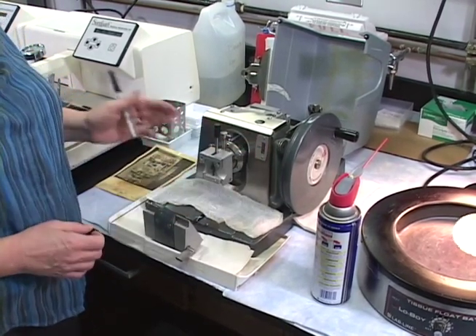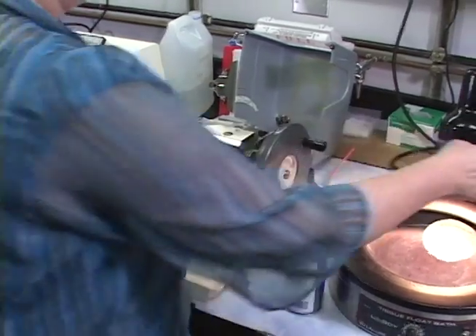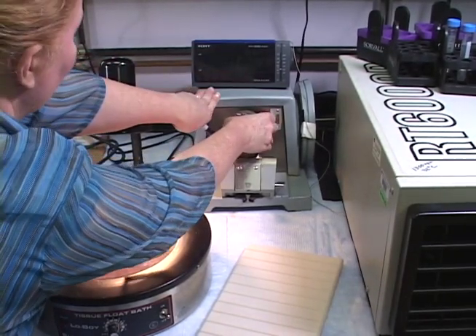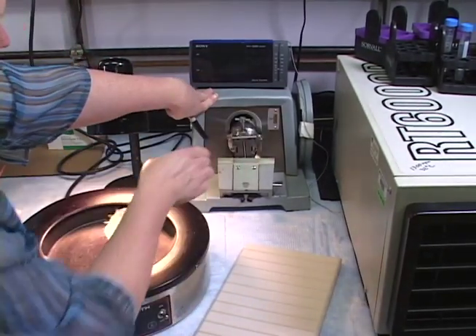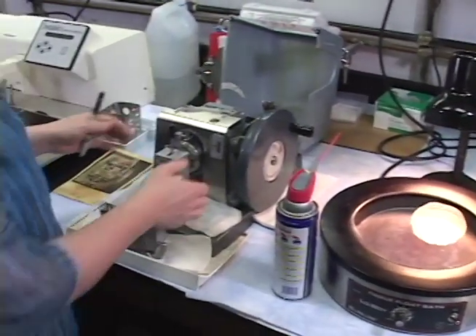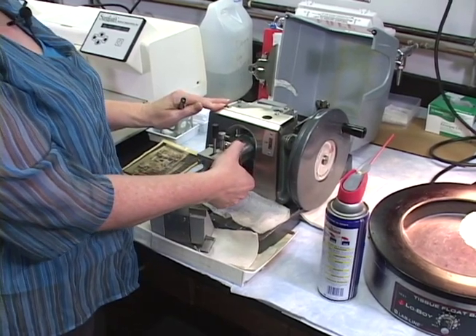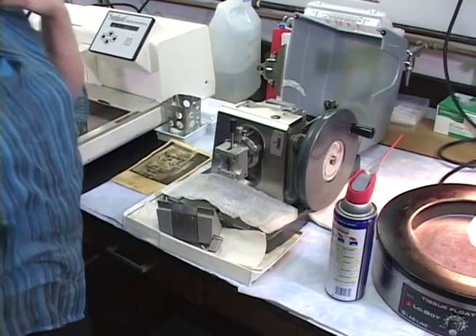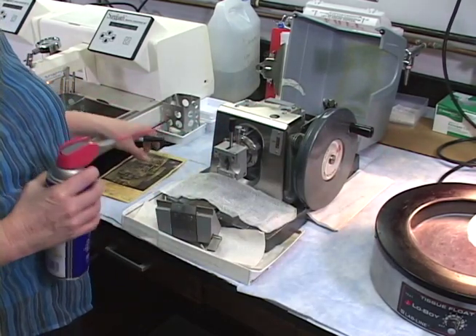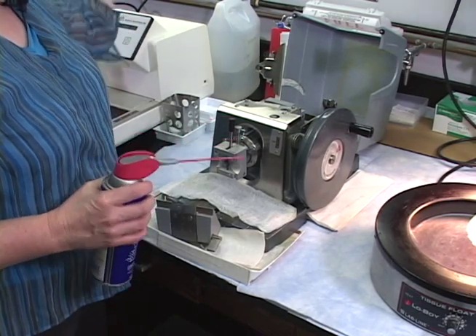As an example, a not very well oiled one like this old one over here would not move freely. It wants to stick, and you can almost not even move it at all. So that's not oiled and not good. Ours, on the other hand, we keep well oiled, and it has a nice movement and slides back nicely. That's because I oil it before every use, every day.